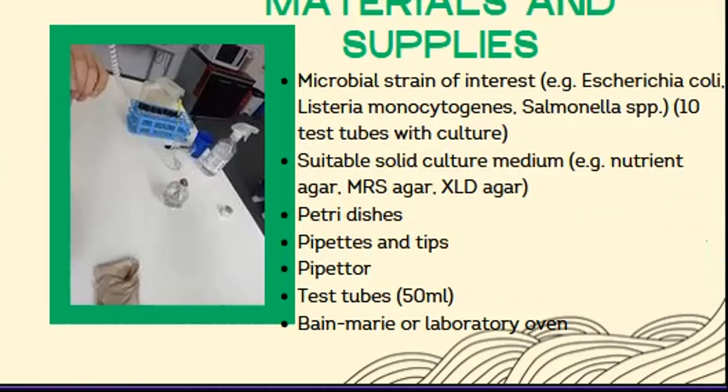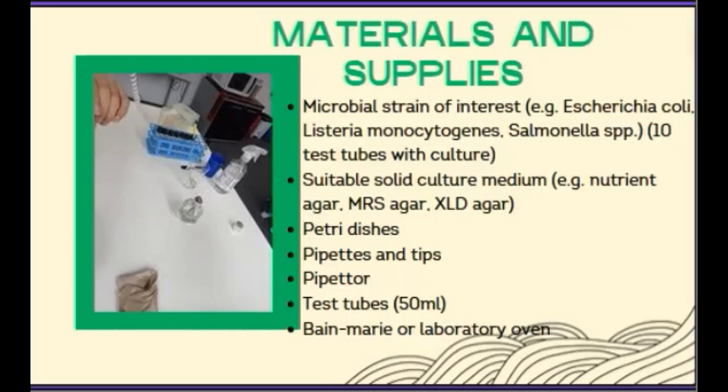Okay, now I will explain the materials and supplies. The principal materials are the microbiological strains of interest: Escherichia coli, Listeria monocytogenes, and Salmonella.